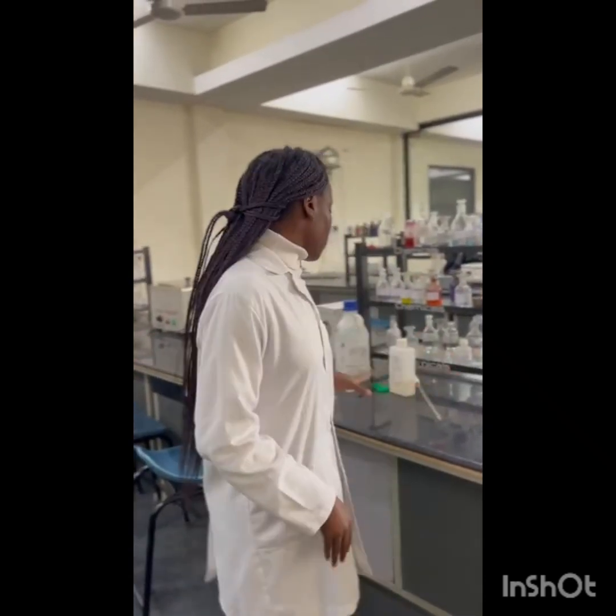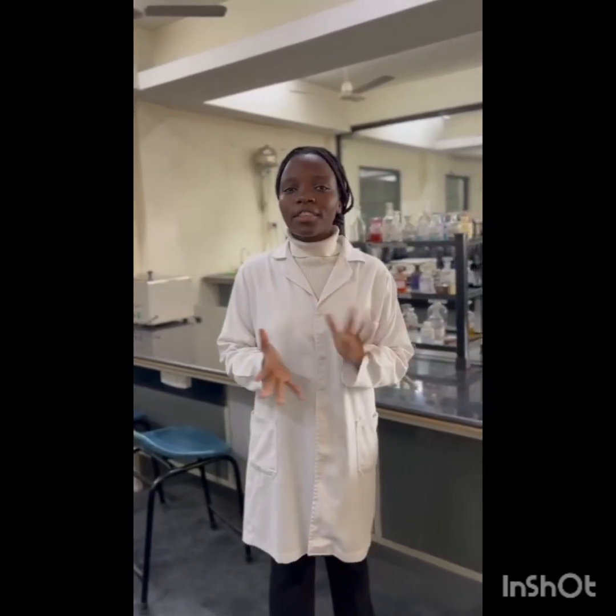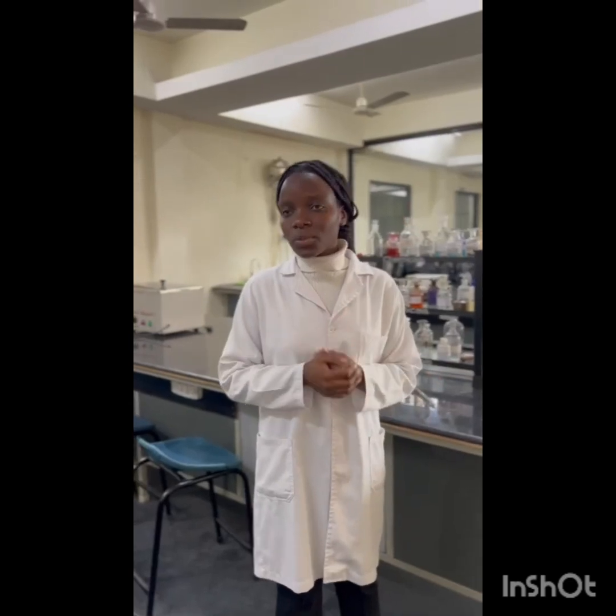decalcification. What you need first is the decalcifying agent. We have to choose, taking into consideration what we're going to investigate afterwards, how much time we have, and what staining methods we are going to use, because all of that can affect the decalcifying agent that you use. I will talk about the main decalcifying agents that we have.